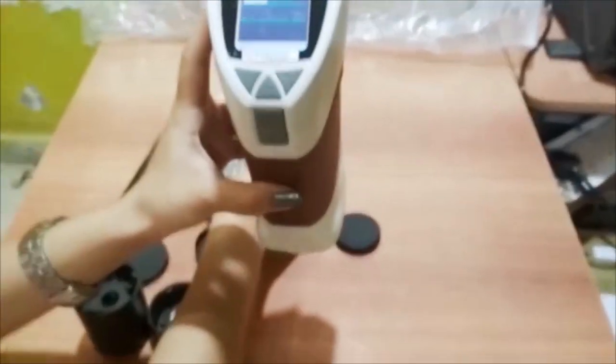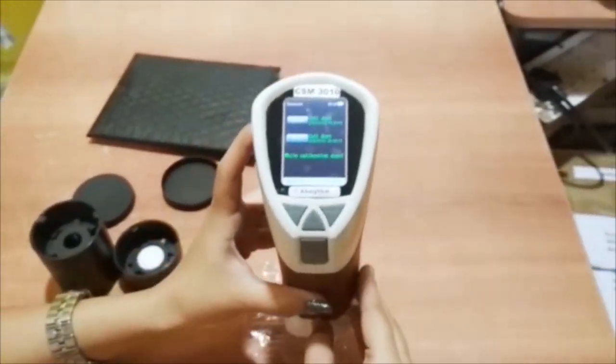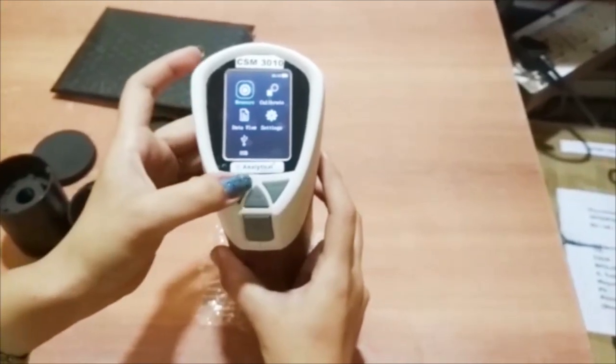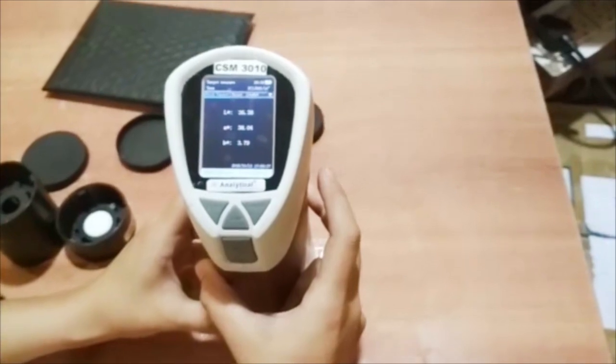After calibration, take a piece of white polythene bag and select measure on the title bar. After that, press the enter button and then click the test button for the result.